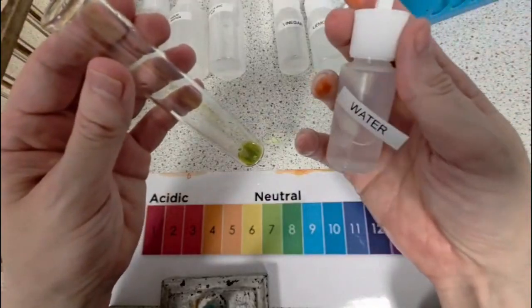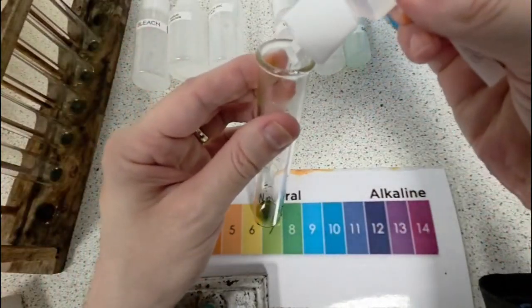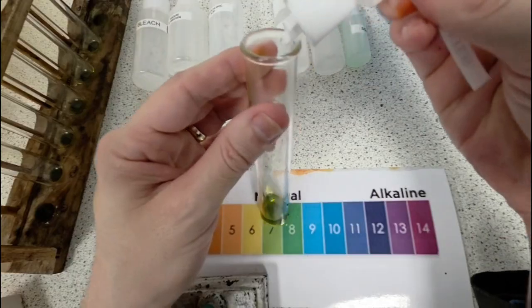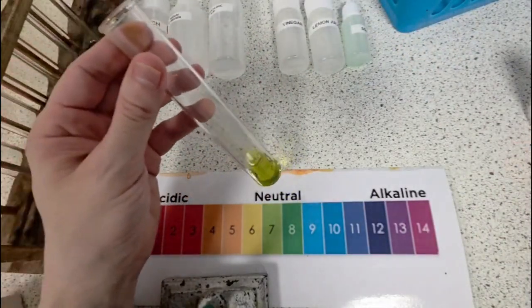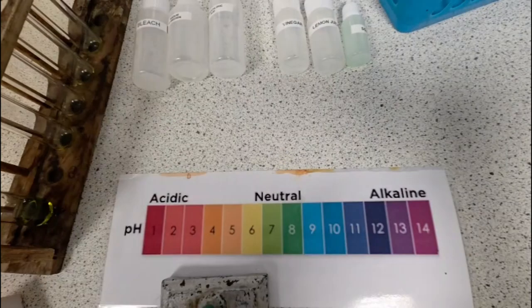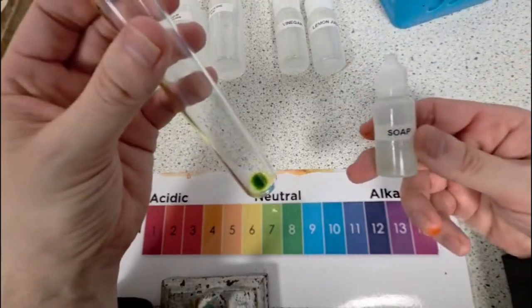So we're going to start with water. I'm going to see what color the universal indicator turns. By adding a small amount of water into there, we can see that it is a nice lime green color, and that corresponds to pH 7. pH 7 is neutral.